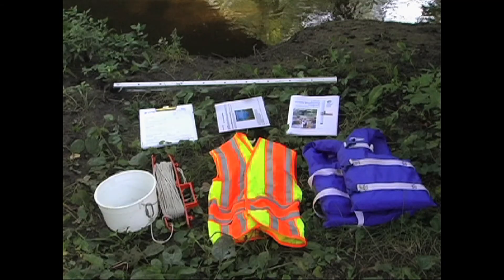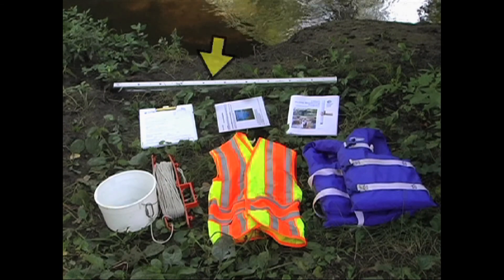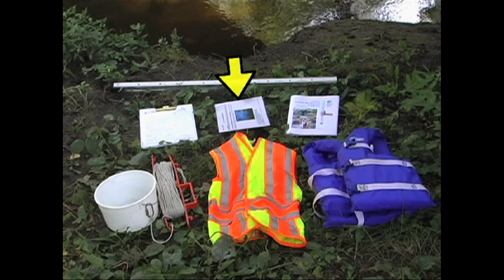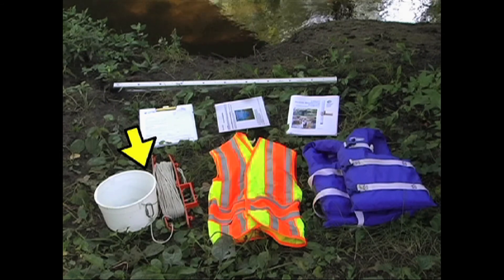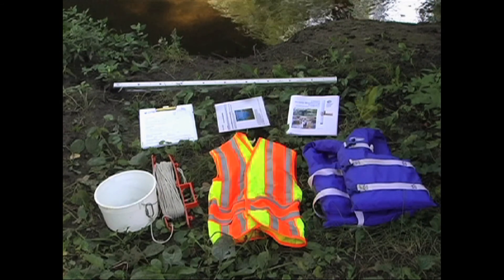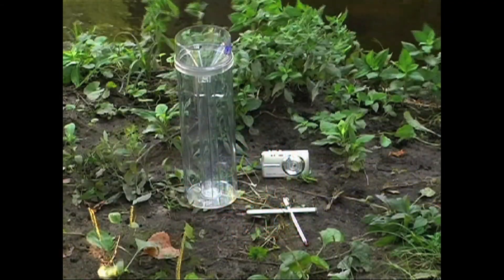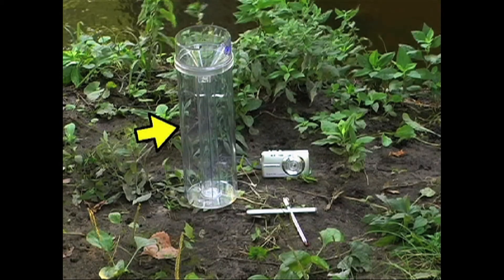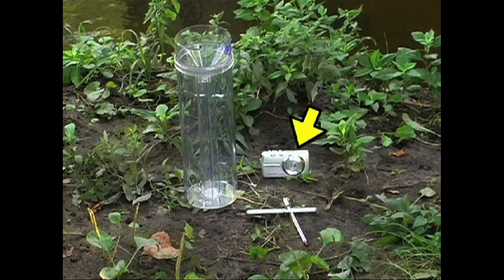To do your sampling, you'll need monitoring equipment. When you join the program, you'll receive a Secchi tube, a stream data sheet, laminated sampling instructions, and detailed instructions as part of your monitoring kit. You'll also need a bucket and rope system, a safety vest if you're sampling from a bridge on a road, and any other necessary safety gear, such as a personal flotation device. If you choose to do optional rainfall, temperature, and photo monitoring, you'll also need a rain gauge, a thermometer, and a digital camera.